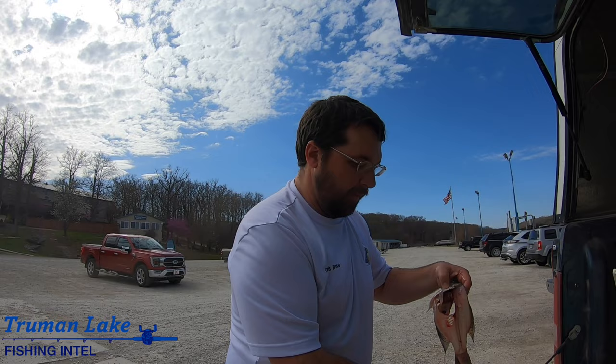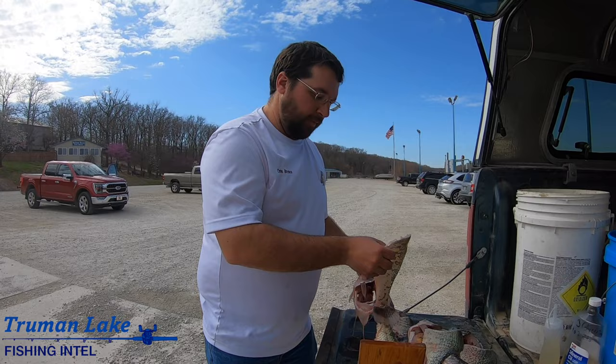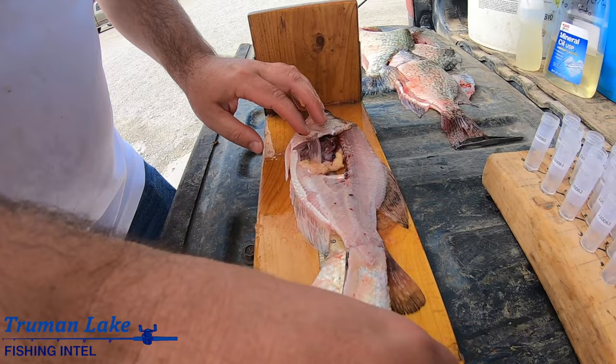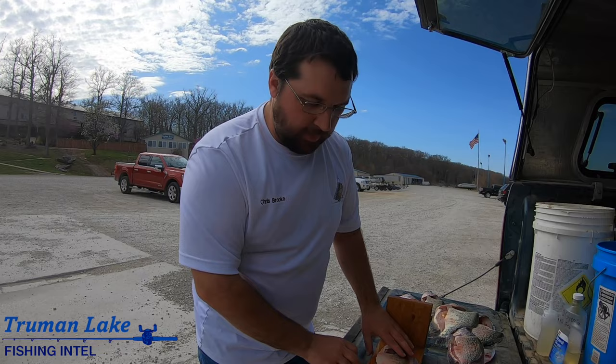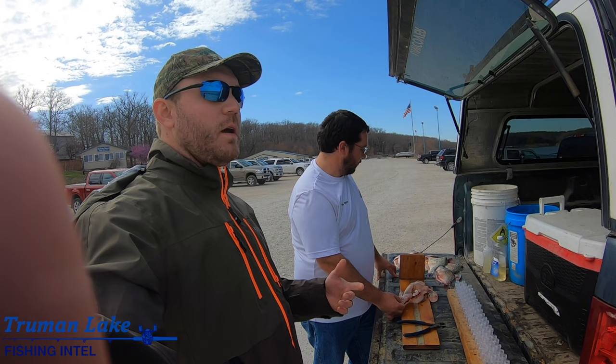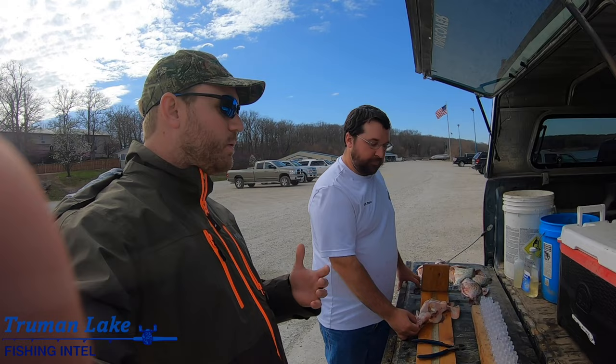We can age the crappie like that, which we'll be showing you later in the video. We fillet the fish and take the information - it's a female white crappie, you can see the bars there, ten point six inches. He's taking the measurements: male or female, white crappie, black crappie, if it's a hybrid, and then as far as the otolith goes, a lot of people don't even know what that is.